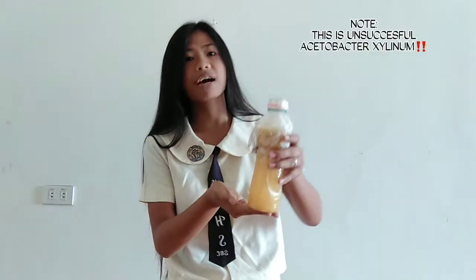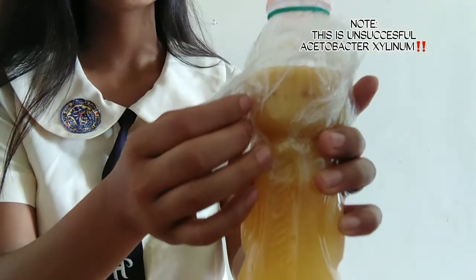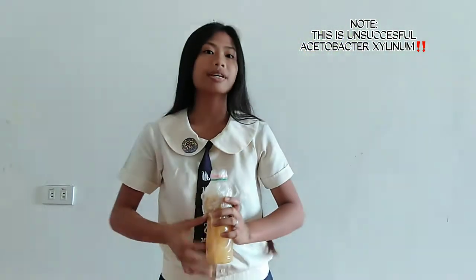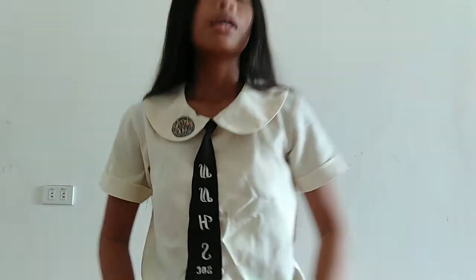This is my failed Acetobacter xylinum. This is the seventh day of this, but it is wrong. This is the pulp and this is the juice. I am very sad that my first ever making of Acetobacter xylinum is wrong. So today, I will be presenting and I'm sure this will be right and correct.